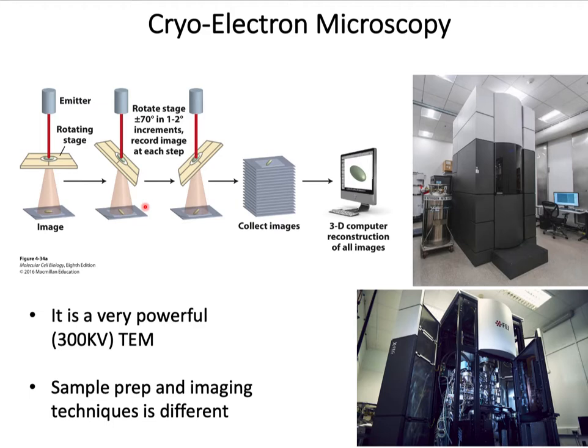To do that, you have to serially section a cell embedded in a block, arrange each slice of the cell in order, precisely, say top to bottom, and then stain each of the sections individually and take a static TEM micrograph of each of them, and then reconstruct a 3D image computationally, merging each individual image. All this labor-intensive, months-long work is solved with much higher resolution by this state-of-the-art cryo-EM.